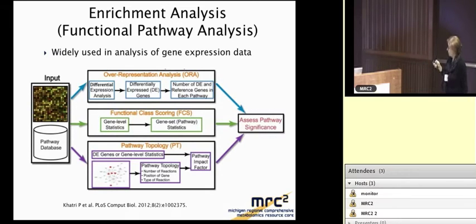What you can do with it is start with your metabolomics data or gene expression data, which Chuck mentioned earlier in his talk. You can map this data onto human metabolic pathways and reconstruct them. The tool will construct the networks and allow you to visualize changes in your data.